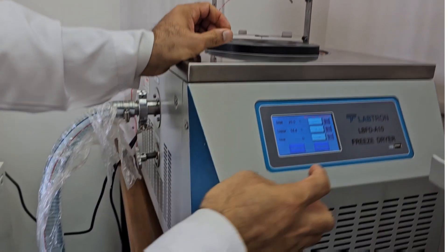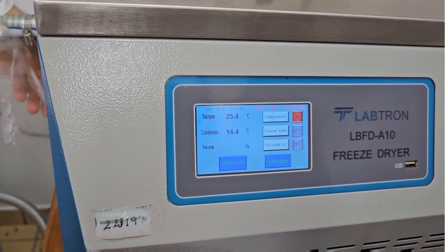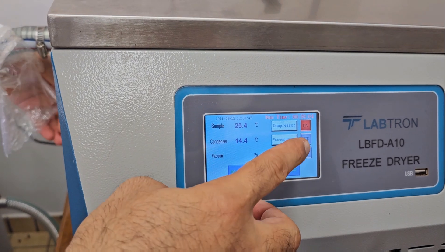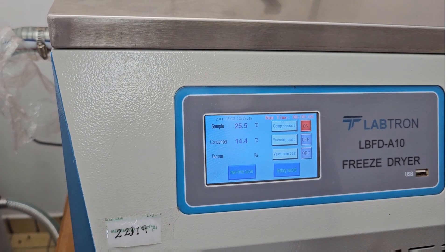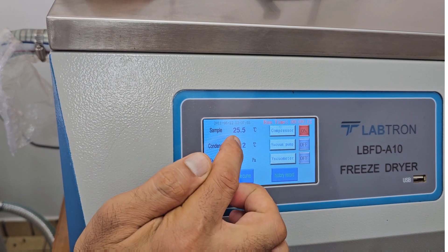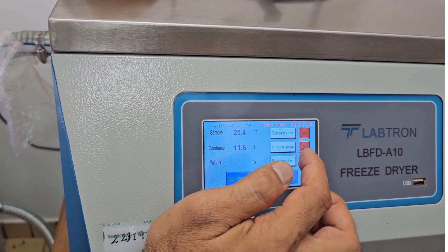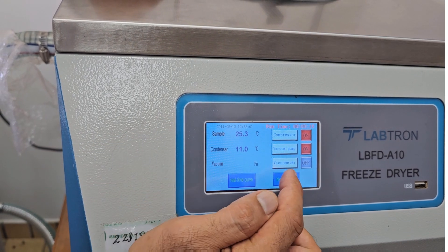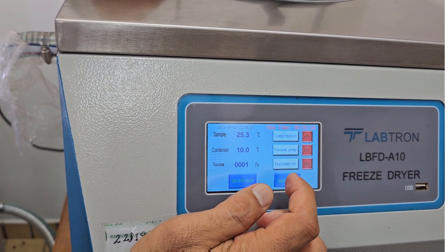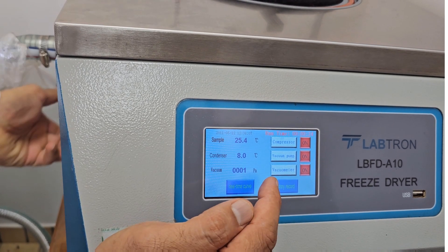The processing starts with the compressor. This compressor runs until the temperature of the cold trap reaches minus 40 degrees, then we turn on the vacuum pump. Once the vacuum pump starts, we also have a vacuum meter, and we wait until the pressure goes to zero.